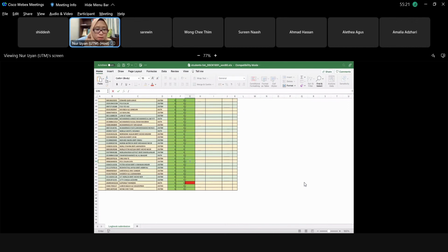Okay, so last one, Ong So Yi. Just now the lab assistant mentioned the one that is being used to determine the compound. For example, if we want to determine zinc, or any other heavy metal such as cadmium, what are the important parts being put in the AAS system? What is the name of the most important part?